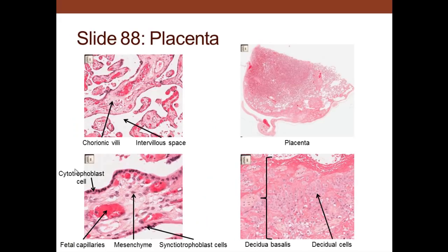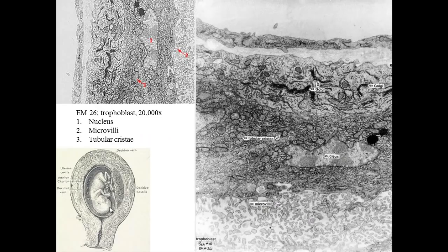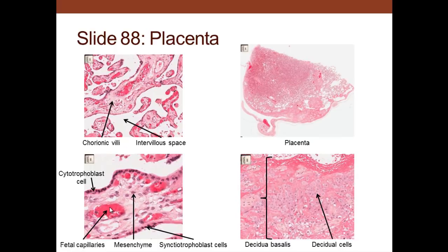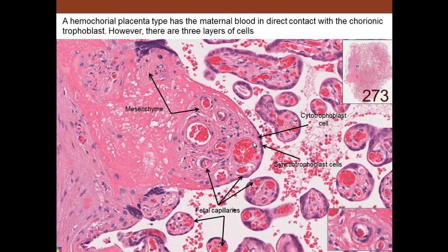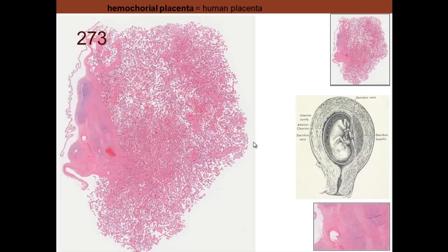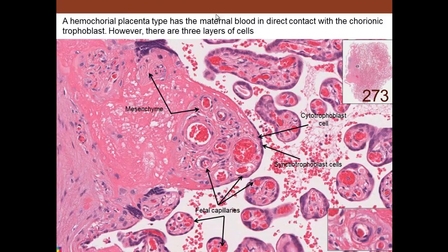Here we see the different layers of the placenta — mother's blood bathes here, and the fetal blood is contained within the villi. Nutrients and oxygen have to pass through the epithelial and endothelial cells to reach the fetal blood. Here we see the placental villi interacting with the mother's blood. At higher magnification we can see mother's blood in the intervillous space, the cytotrophoblast on the inside, and the syncytiotrophoblast — which is invasive — on the outside, and then the endothelial cells of the fetal blood vessels.